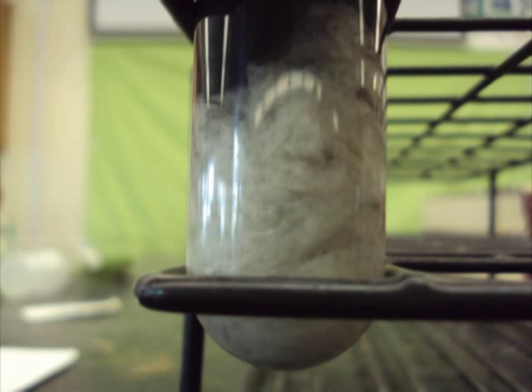In the bottom of the column, there is anaerobic sediment. This is because the cellulose depletes the oxygen in the residue and in the water. Anaerobic bacteria will then grow and produce hydrogen sulfide. In this case, Desulfovibrio and Clostridium are predominantly the bacteria.